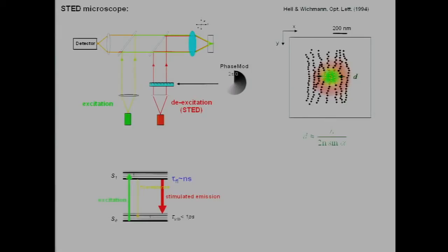And so what do we have to do? You could say, make smaller rings. If you have smaller rings, then it should be possible to see more specifically the strand here in the center. But Abbe would say, no way, you can't make smaller rings because that's also limited by diffraction. Now, fortunately, we don't have to do that.